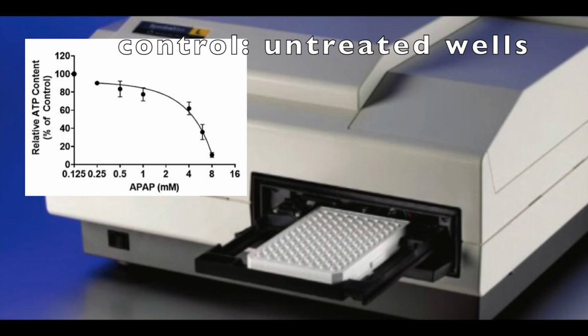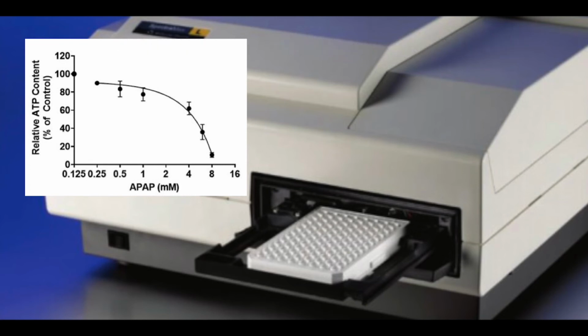100% of viability is set to the control, i.e. untreated wells, if microtissues were subjected to a drug treatment. Here we show an example of a drug treatment that was performed. So spheroids were exposed to paracetamol, and we can see that by measuring the ATP and comparing it to an untreated control, that we have a relative decrease in ATP.